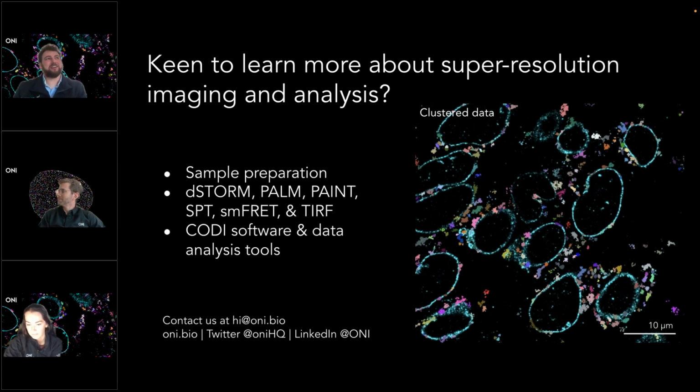If it calculates no drift, then that should mean that there has been no drifting during your experiments, during those 10,000 frames. You can verify this by coloring by the frame index, as I showed, and you should see no rainbow streaky patterns.